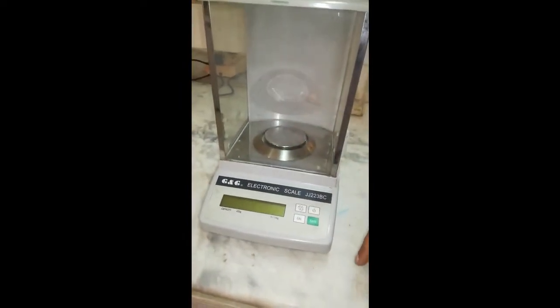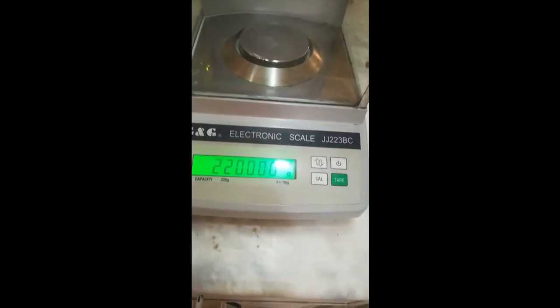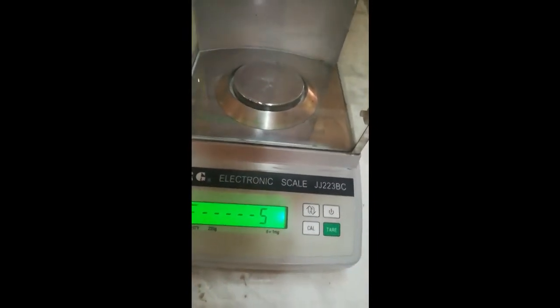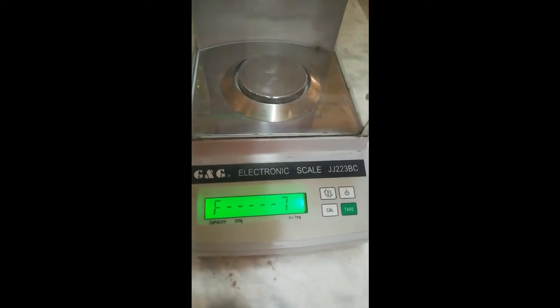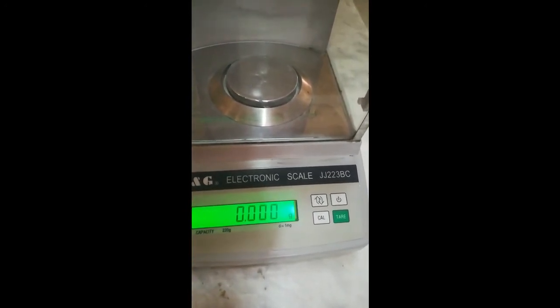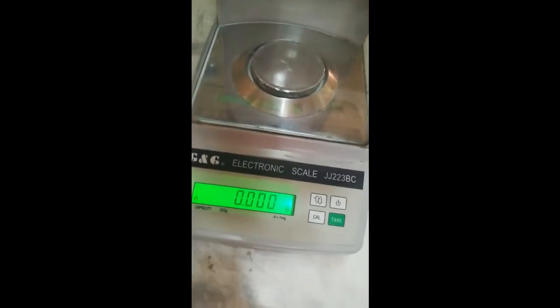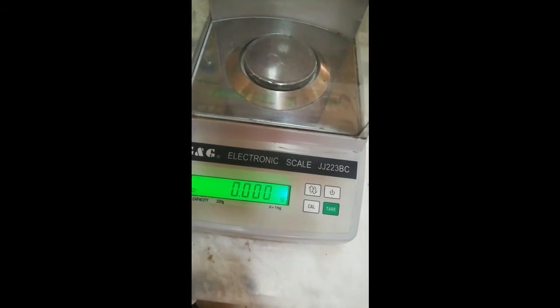For the use of the top loading balance, we will switch on the equipment. It will take some time to load its program.